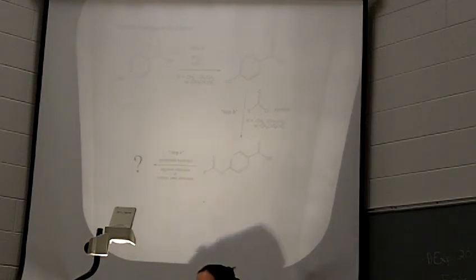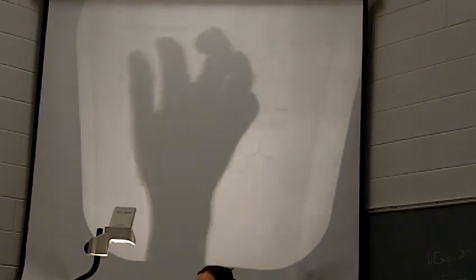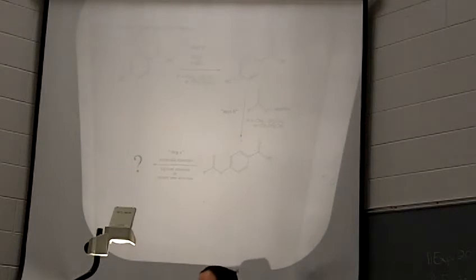And then what we're going to do is use enzymatic hydrolysis and try and figure out which enzyme and which configuration of esters works well to get to the desired compound, okay, or the desired analog that's the precursor to the desired compound, okay? So this is kind of our 3 steps. And so how that breaks down, because we're adding all this variation to this project, is a table like this.